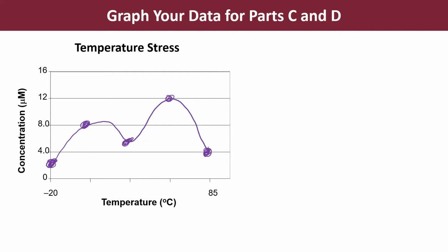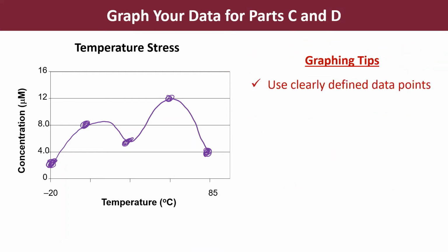Now, this is not the trend that you're going to see. You're going to see a different trend. I will leave that as a surprise for you. But what I do want to do is give you some graphing tips. First graphing tip, use clearly defined data points.